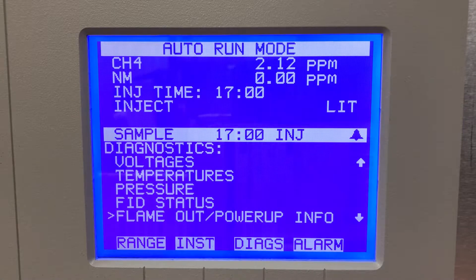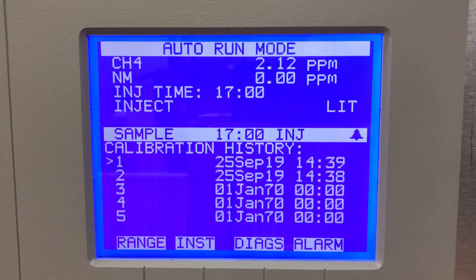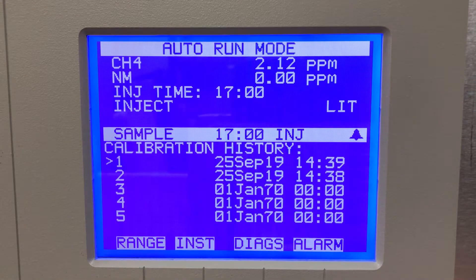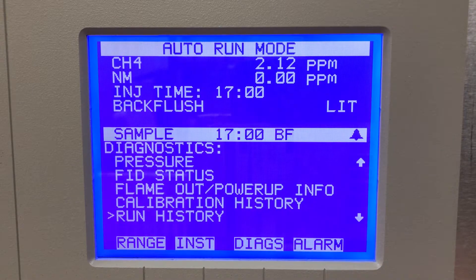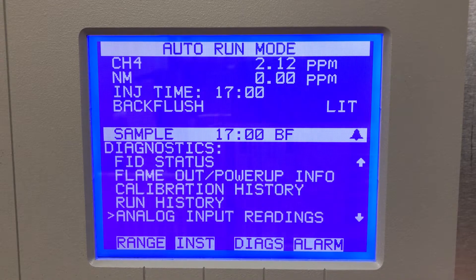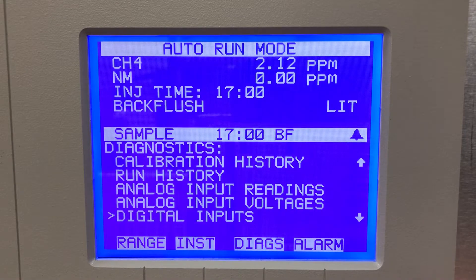It tells me if there's a flame-out issue. I can look at my calibration history — it shows me the dates it was last calibrated, so it has a good log for calibration histories. Run history again shows dates on the runs — lots of ways to troubleshoot this instrument.